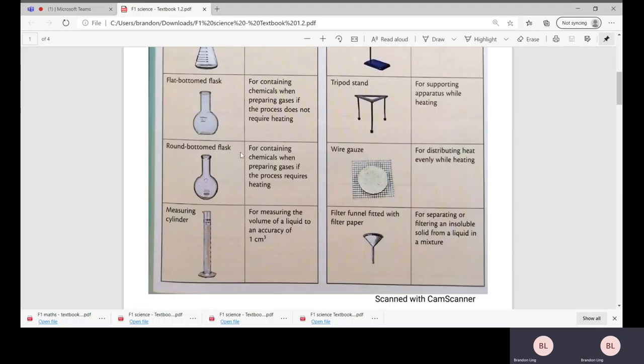Next you have your tripod stand on your right. Tripod stand is basically for you to place a wire gauze on top of it and also the flat bottom flask for boiling or heating purposes. The tripod stand is for supporting apparatus while heating.